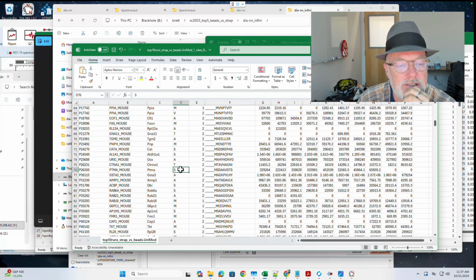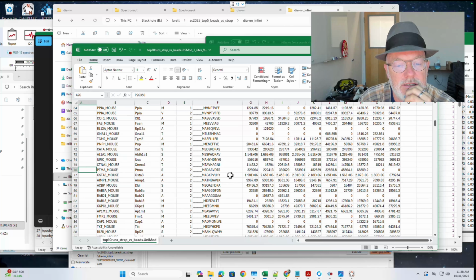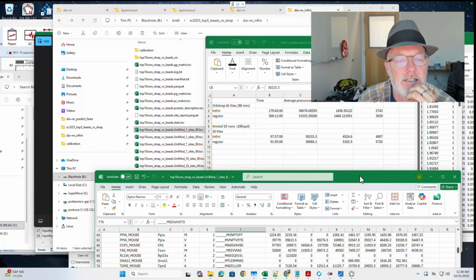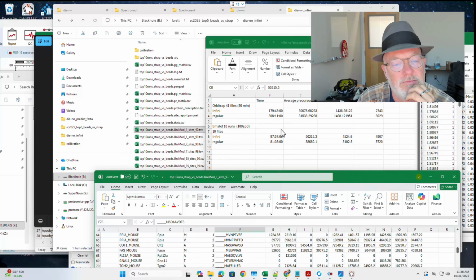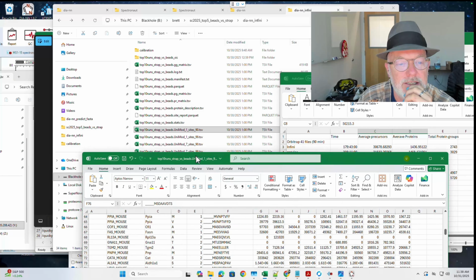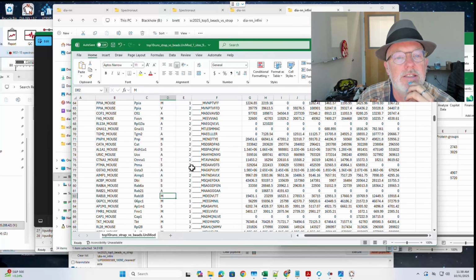And so, for example, residue S. That's interesting. Unimod 1. So is it saying that's acetylated? Wait, which site? That's interesting. Why do we have 2 here? I think I accidentally have 2 copies. I don't know why. And that's interesting. Why does it say Unimod 1? All right, let's look at something else.